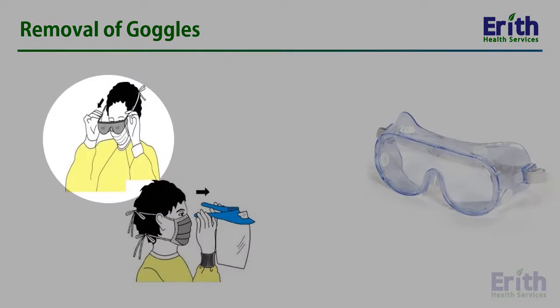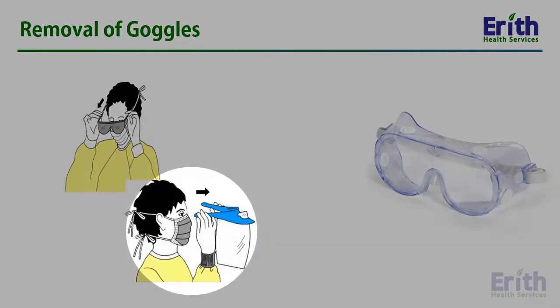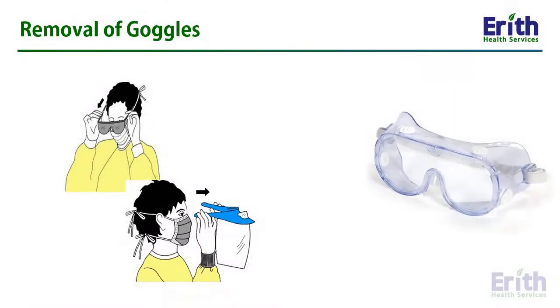Removal of goggles. Grasp ear or headpiece with ungloved or gloved hands. Lift away from face. Place in the designated receptacle for disinfecting or disposal.